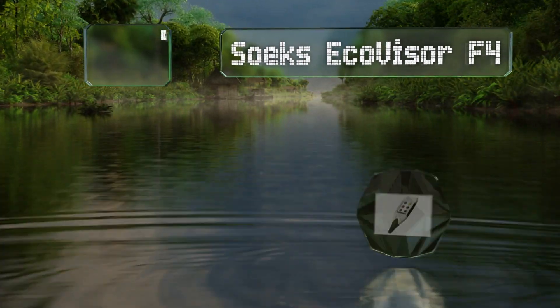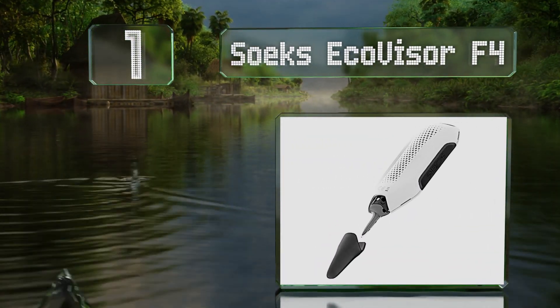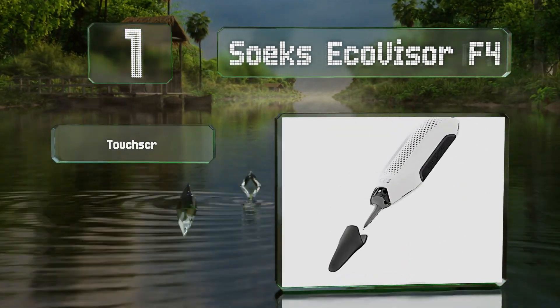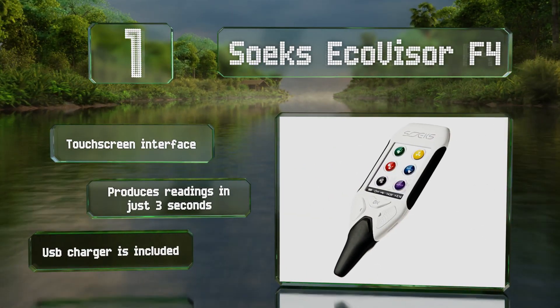Coming in at number 1 on our list, the versatile Soeks Eco Visor F4 is a four-in-one model that can monitor radiation, electromagnetic fields, nitrates, and total dissolved solids. It's equipped with a touchscreen interface, includes a USB charger, and produces readings in just three seconds.